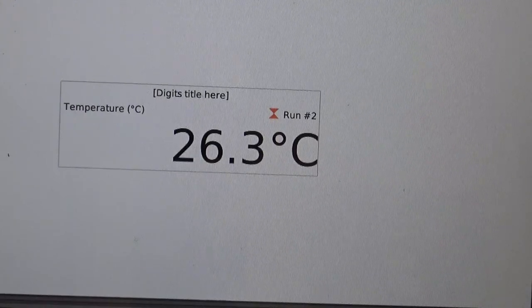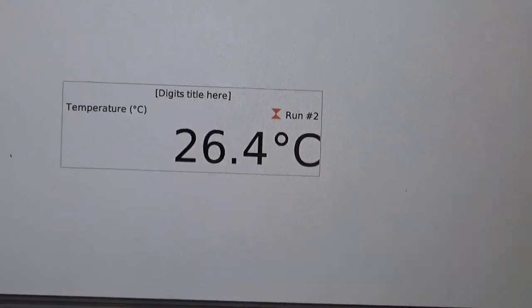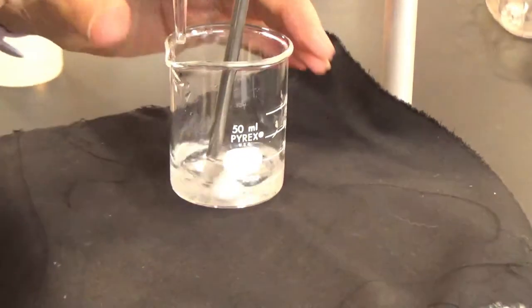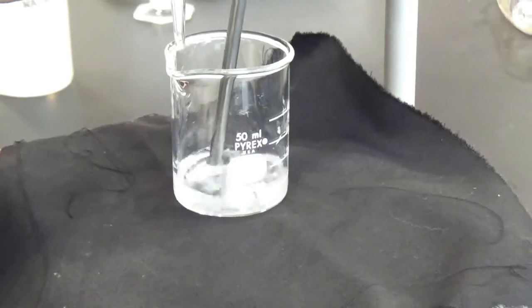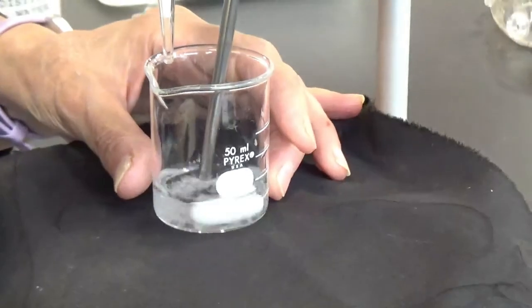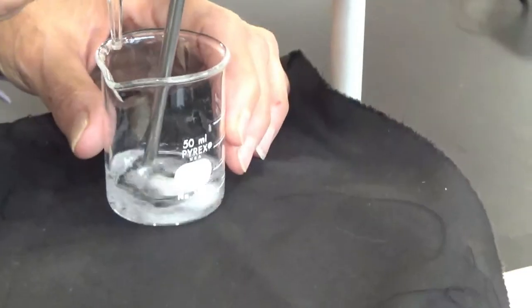When it reaches 27, I think I'll add some more water. If I can wait that long. Maybe I'll put just a few drops. Put something in there. Yeah. When it... oops. Not that easy to see, I gotta tell you. Well, I can't even tell, it's so close to the edge. Yeah, I see drops. But there's plenty of crystals still in there.